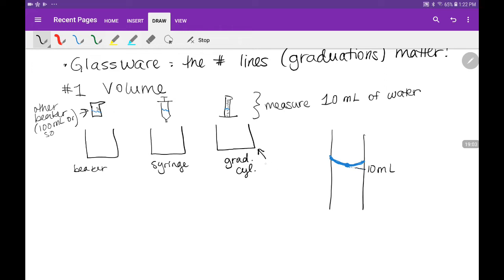So we're going to take these containers that have been pre-weighed. And you've marked your weights for each one of these beakers that have been labeled into your lovely little table. So that's going to be the initial mass of the labeled beaker. That's step five. So we've pre-weighed those, we've recorded that in table one. Then you're going to take this liquid and dump it in here. You are not going to use anything else to transfer this. The liquid is coming straight from this measuring device that you've measured to 10 milliliters straight into here. Then you're going to weigh it again.